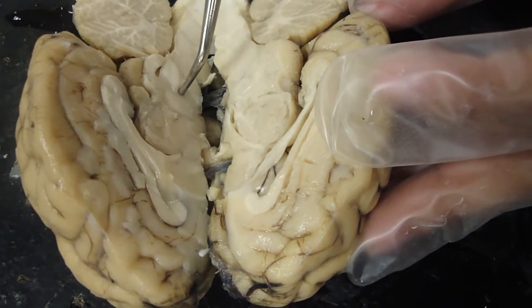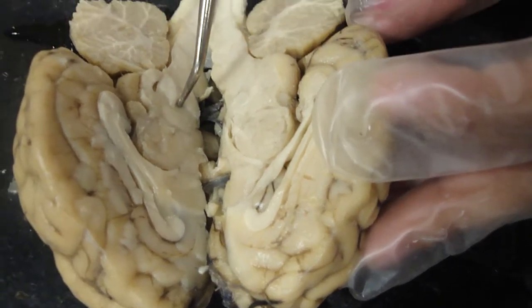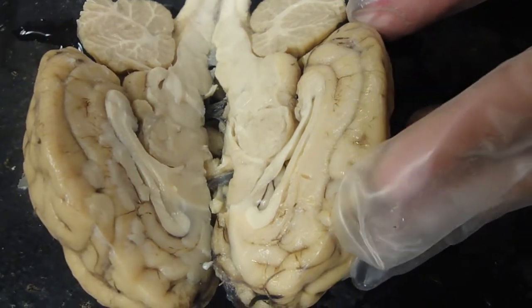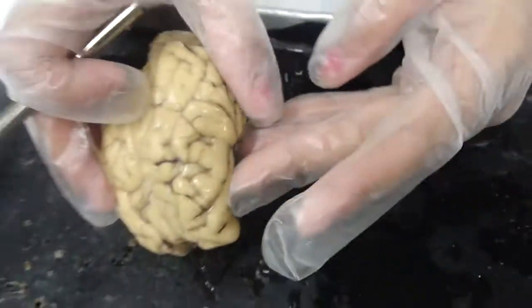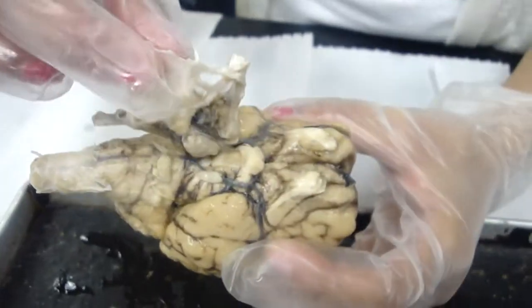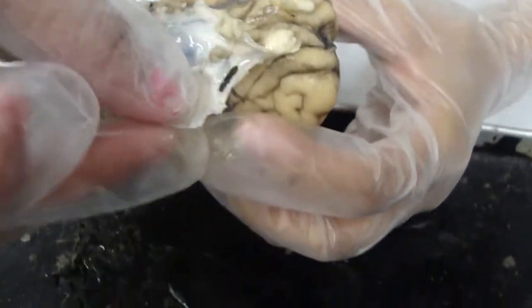The pituitary gland is not on this particular brain. It's been removed, so some of you may have pituitary glands, some don't. If you flip your brain upside down and the pituitary gland is still in place, it'll be a large structure hanging off the undersurface. I do have the pituitary gland still in place on this one, and that's why I saved this one. Do not pull it off.